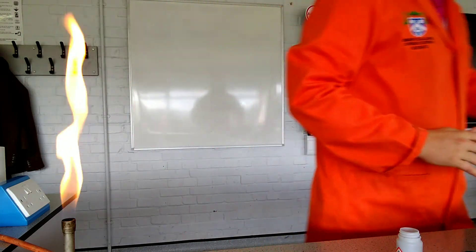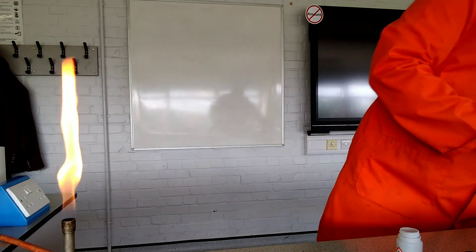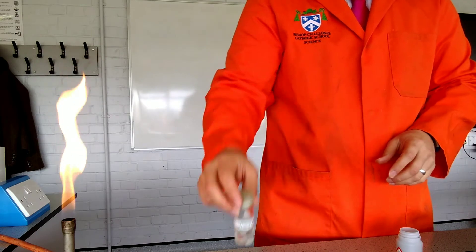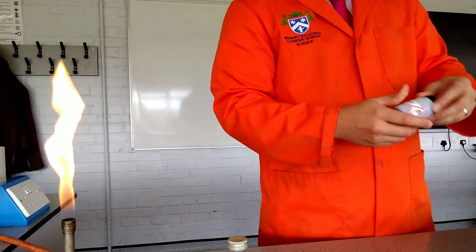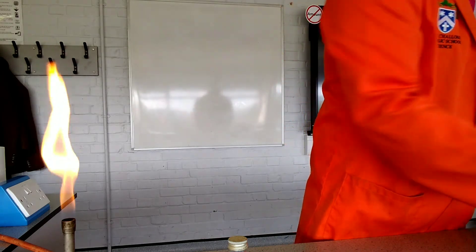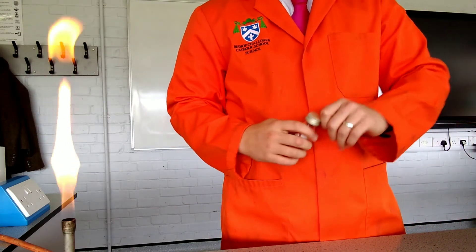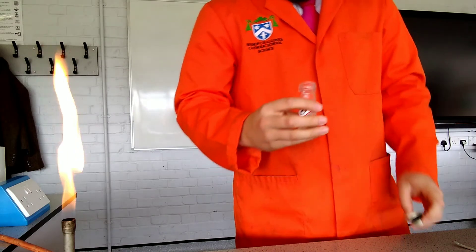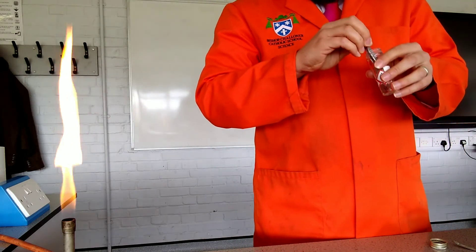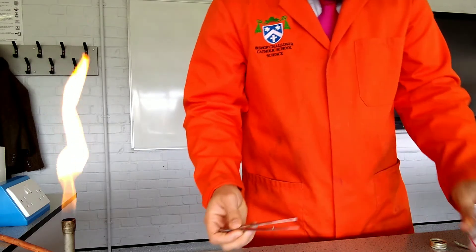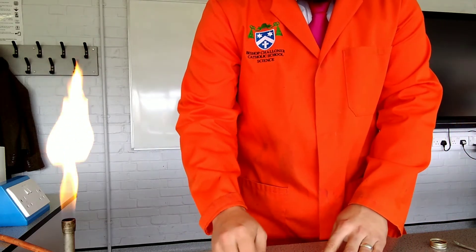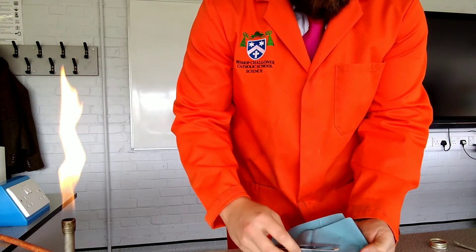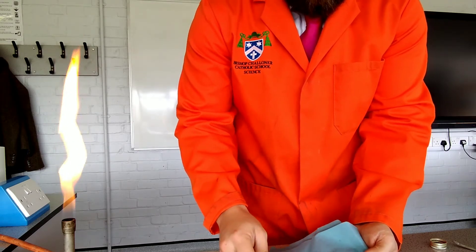Finally, we're going to look at sodium. Now, sodium is really, really reactive. So our sodium has actually been placed in some paraffin oil, and that stops it reacting with the sort of small amounts of oxygen in the air. And that's really, really important because otherwise by the time we came to do any reactions with sodium, we wouldn't have any sodium left because it would have all reacted. So what I'm going to do, first of all, is just take a tiny bit of that oil off of the sodium. So I'm just going to use this bit of blue roll here just to remove some of the paraffin oil. And I'll just show you a bit of sodium here.